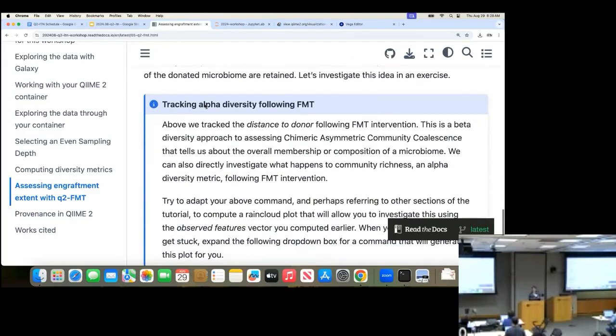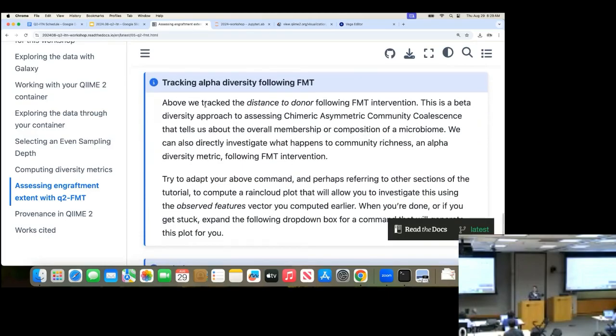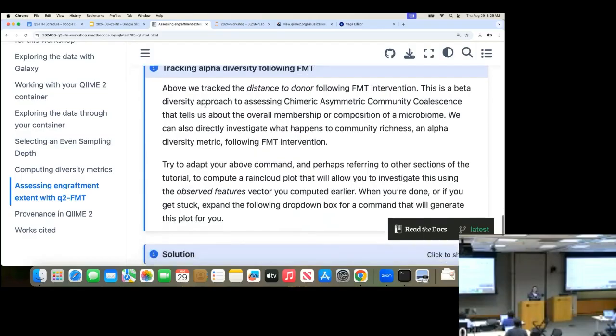I talked a little bit about how if I wanted to better understand the stability of my sample, one thing I use a lot is alpha diversity. If I can prove that maybe they don't look like their donor, but that the alpha diversity was maintained after bouncing back away from their donor, that to me is a good sign that a unique microbiome is emerging, but that it's not going back to their baseline, because typically baseline has low alpha diversity.